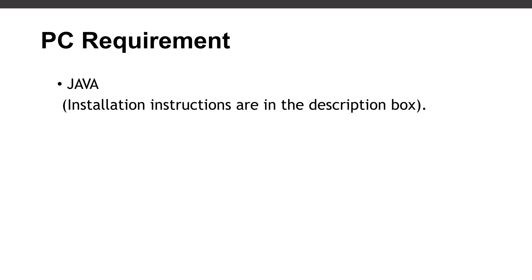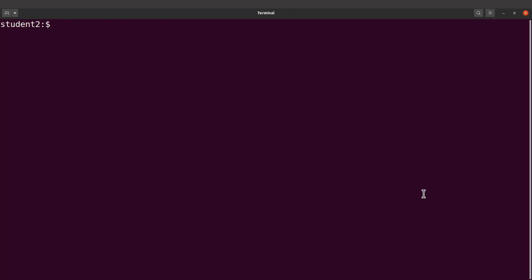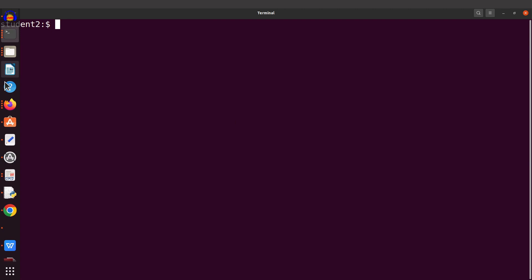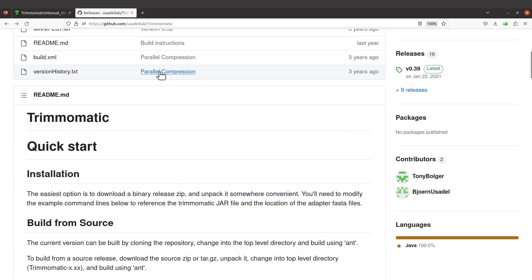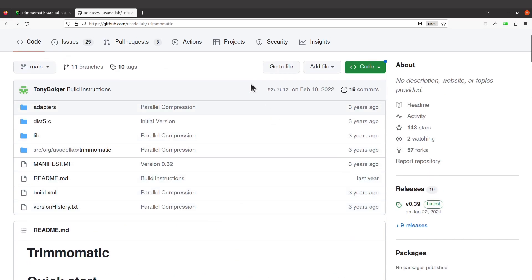Now let's get started. Let's first open our terminal. Now let's go back to the GitHub page. When we are here, come to the installation section. It says the easiest option is to download a binary release zip and unpack it somewhere convenient. The binary release zip has the JAR file, and that is what we need. So what we need to do first is to download this JAR file.